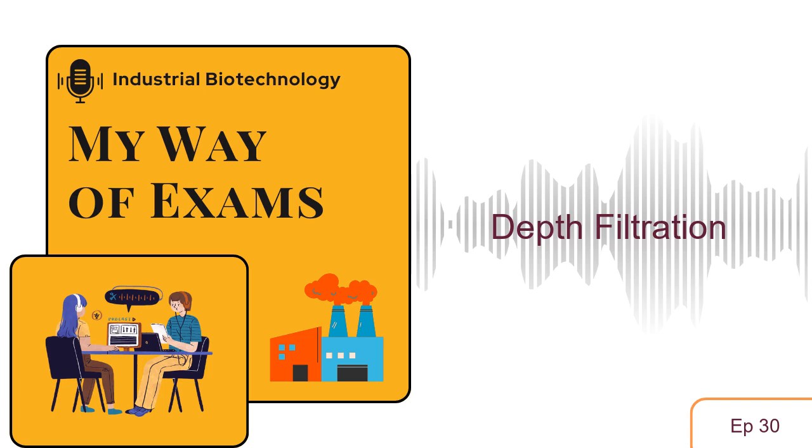Yeah, like a bouncer at a club. The depth filter is standing at the door, keeping out the riffraff, so the VIPs can get through to the real party. And those VIPs, in this case, are your delicate and costly membrane systems and chromatography columns. Right. Makes sense. It's protecting the more sensitive equipment from getting overloaded, breaking down. Exactly. You don't want those expensive systems to get clogged up and fail prematurely, so you use depth filtration as a sort of first line of defense. It's all about increasing efficiency and saving money in the long run.